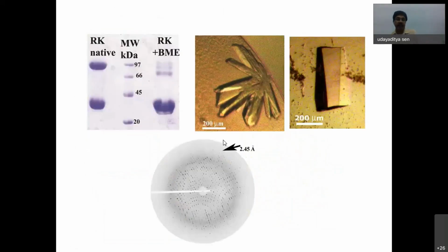Okay, this crystal, this is a ribokinase crystal. I was getting crystal, but size was very small. And not only small, after some time the crystal growth ceased. The crystals came in the drop at about 10 days or so, maybe a small crystal. So after that I waited for another 10 days, but there was no improvement. So a 20-day-old drop in the fridge, I ran a gel, SDS-PAGE gel.